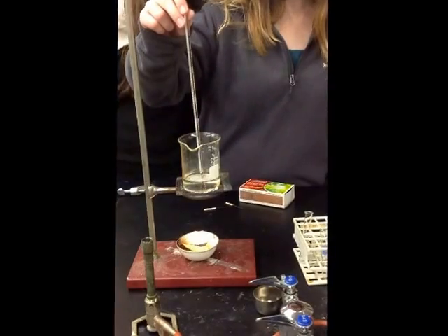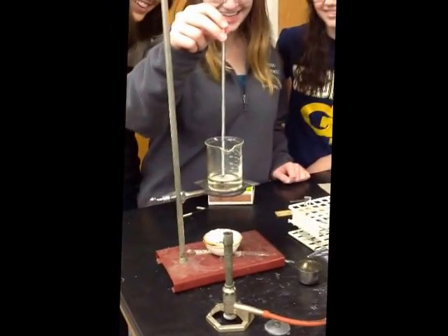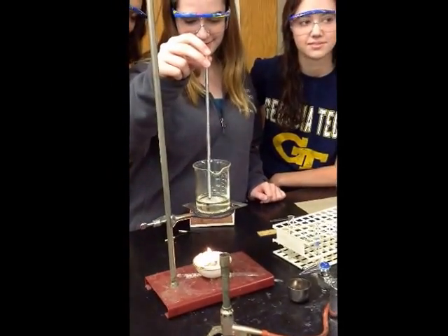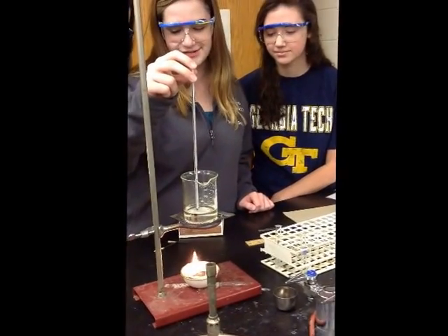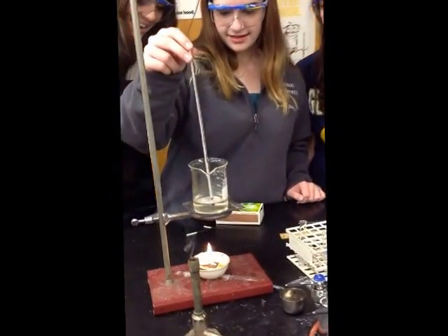Good, Danny. You set it down. It's not allowed to be more than 10 centimeters. Right there. Look at that. Let me see, darling. Yeah. Is it burnt enough or should we light it again? I would light it. Did your temperature rise at all? Yeah, like 2 degrees. Let's try one more time. One more time. Ladies, nice work over here.